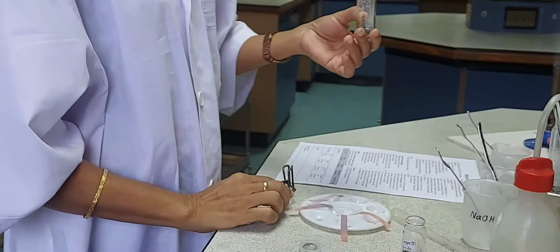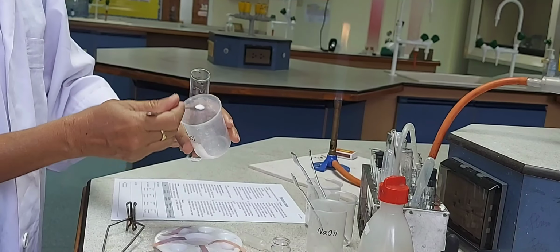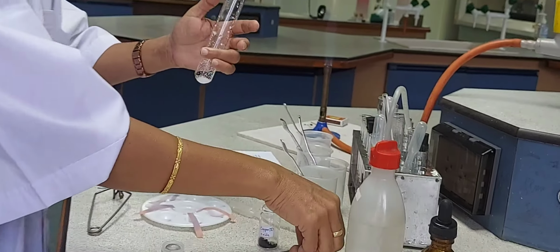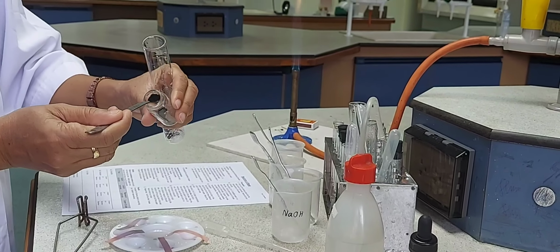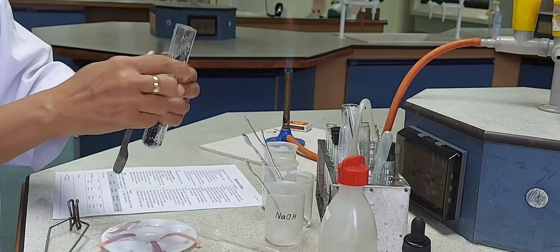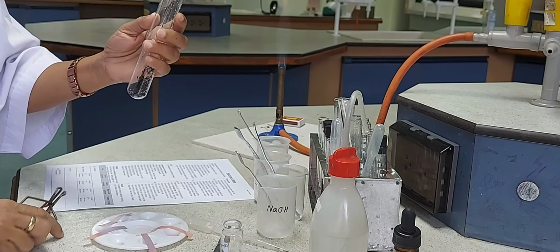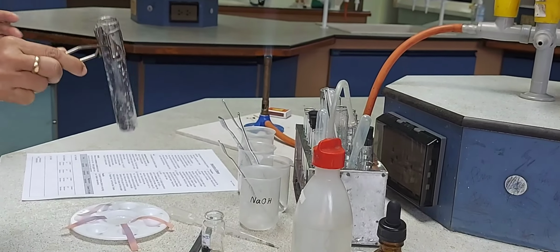In a test tube, I will add ammonium chloride and copper oxide, and heat the mixture.